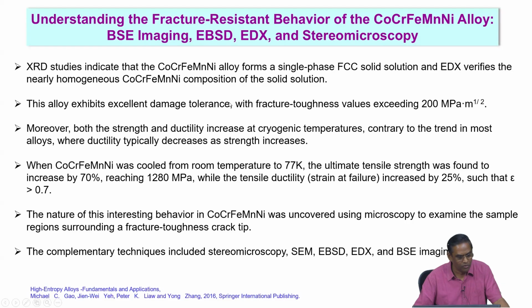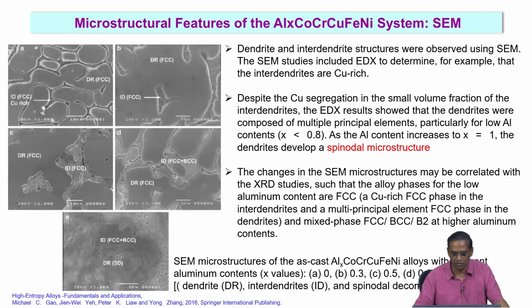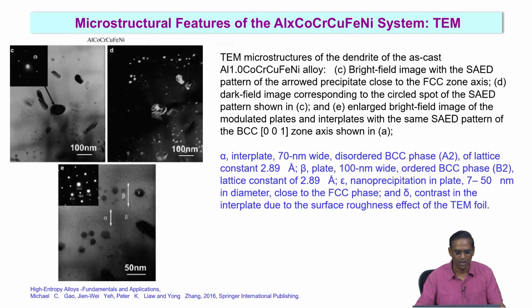EDX, we have been using EDX. I think I did not mention that, I did not show that. Mostly I just mentioned the EDS results showed what the dendrites were composed of. I did not show that spectrum here, but the primary focus was to compare the X-ray diffraction, electron diffraction, SEM morphology and TEM morphology, phase evolution. Of course, EDS we have used. I didn't bring that spectrum.